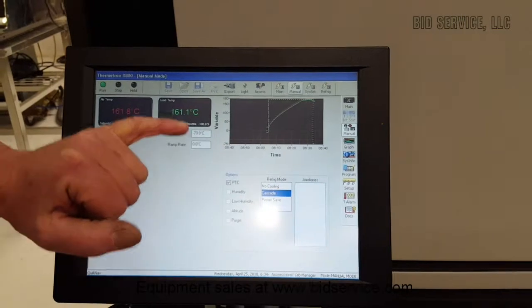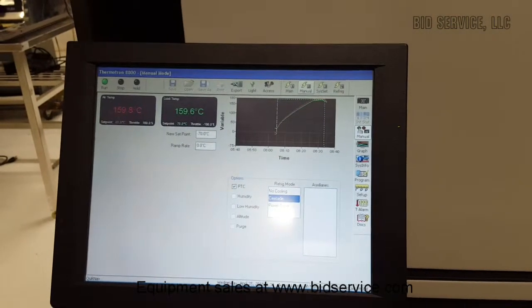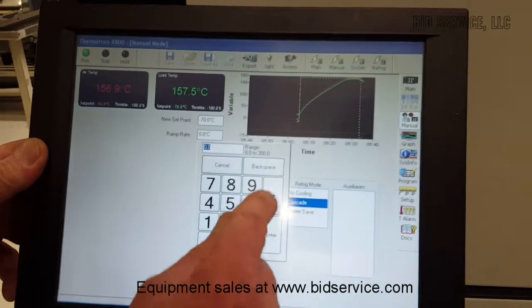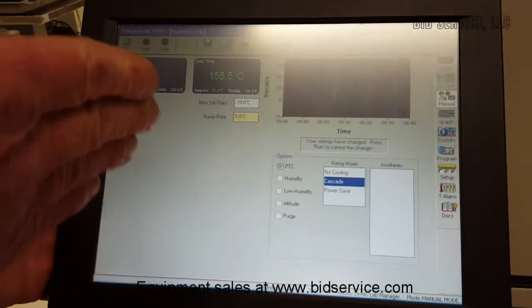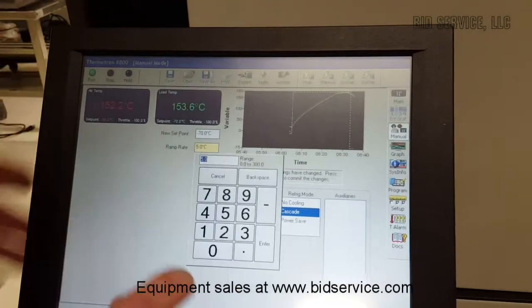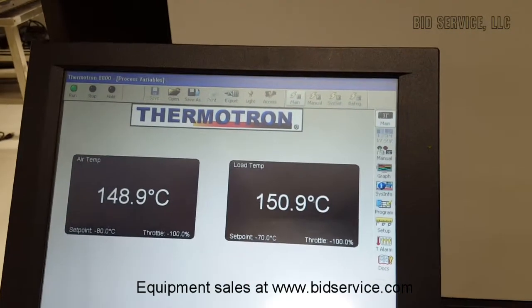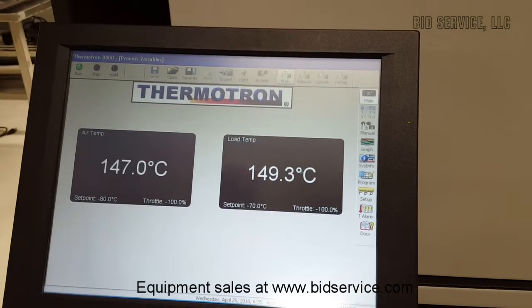Another point is the ramp. Right now I have no ramp rate, which means this is going to go as fast as it can in one direction or another. However, if your test application calls for a slow ramp up or a slow ramp down, you can set this to any degree you want. For example, if we wanted it to go 5 degrees per minute, it'll ramp up or ramp down at 5 degrees per minute. But for now, we want to go as fast as we can, so we'll just enter a zero. We're already on our way down, and we'll come back in probably about 45 to 50 minutes.